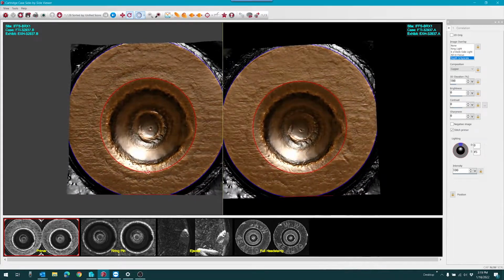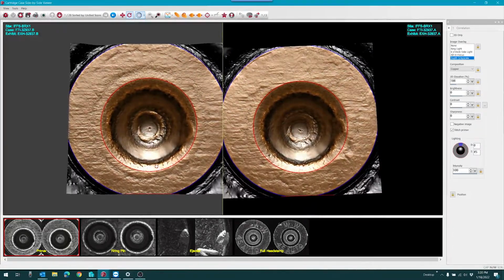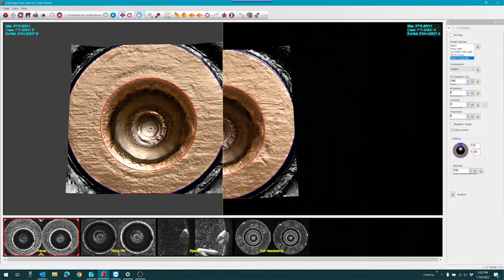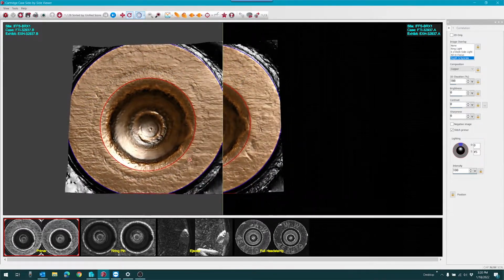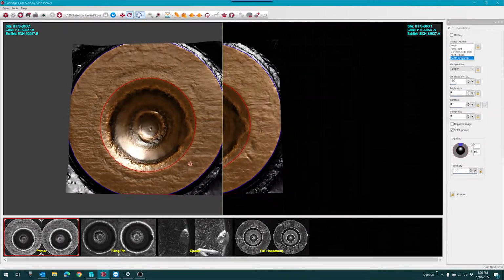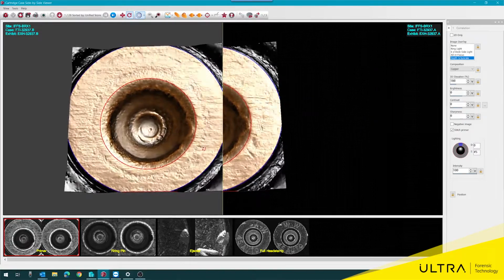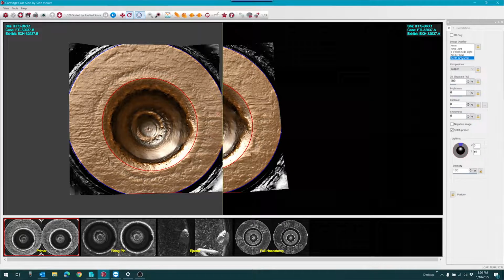And I love to have that little bit of wiggle under the light, because as both of them are moving simultaneously here, I will focus on the two cardinal points that are similar between the two. So if I'm looking at the far right side here on this one, I'll concentrate on the far right side over here as well. And I could even bring him over to bring him closer. And I want to see when and how different features react at the same time, at the same place on both exhibits there. And having that reference locked and moving both simultaneously is a real powerful tool to see when those topographies have information that's in sync between each other.